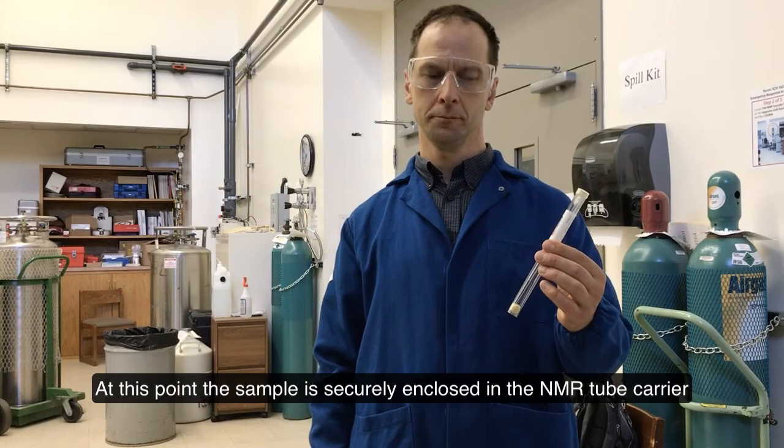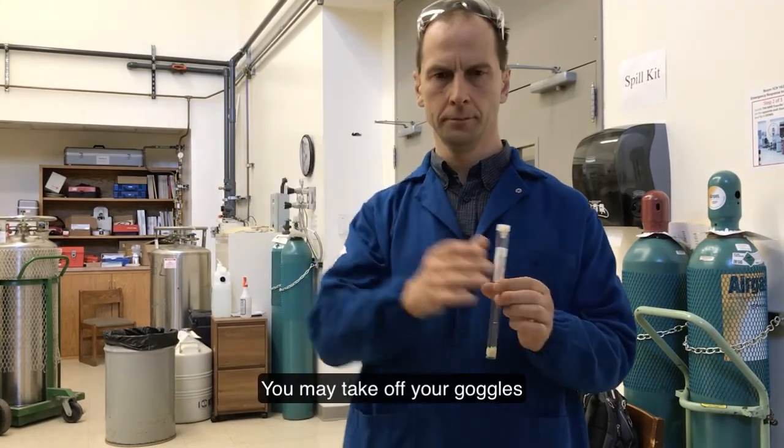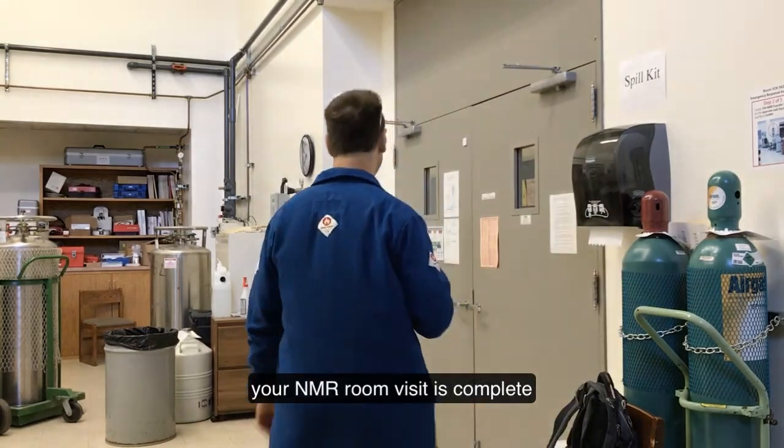At this point, the sample is securely enclosed in the NMR tube carrier. You may take off your goggles. Your NMR room visit is complete.